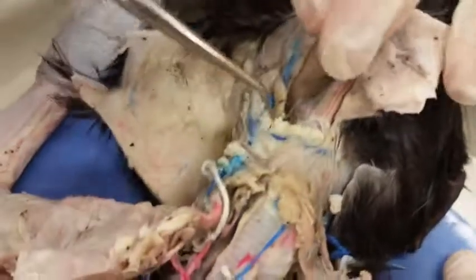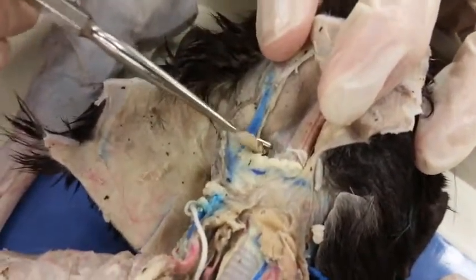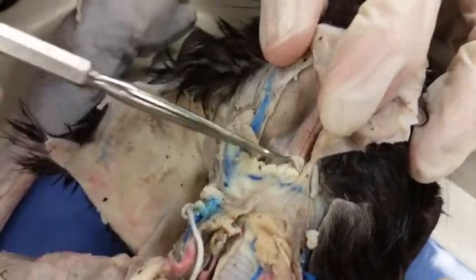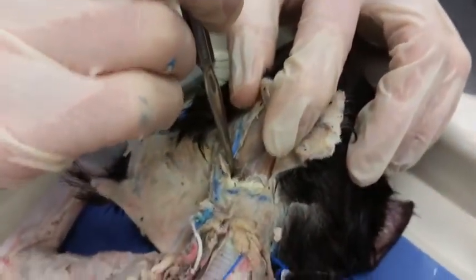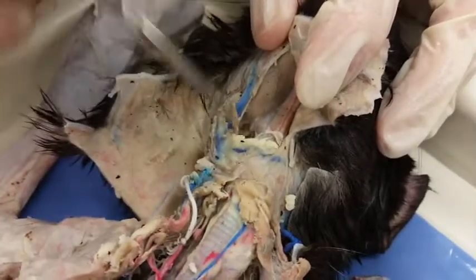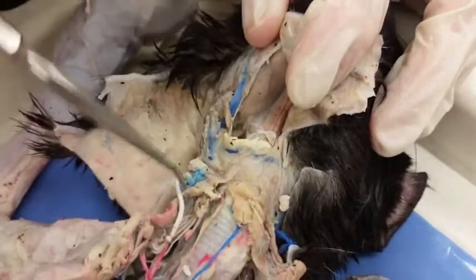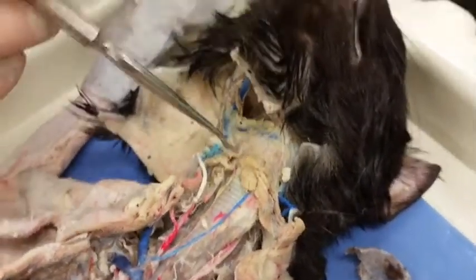And then looking down here more, the parotid glands are going to be right here. Again, we have more mandibular glands. The mandibular glands are right underneath. Again, more parotid ducts right through there. And then sublingual gland continues to run just down and through. Pretty difficult to see, to be honest.